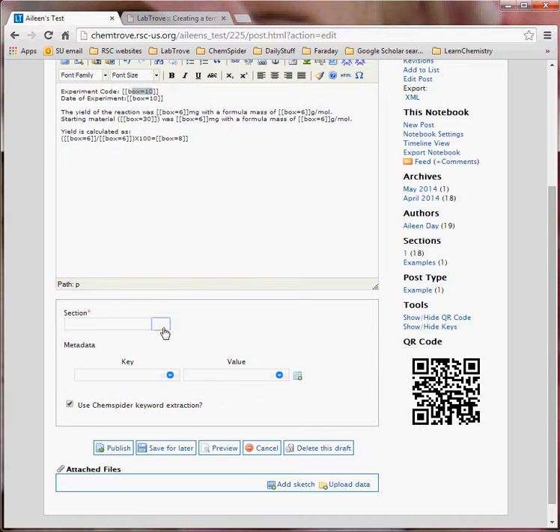And the other important thing when making a template is to set the section to templates. So that should be an option whenever you make a post. So those are the two things you need to make a basic template: a box and templates.